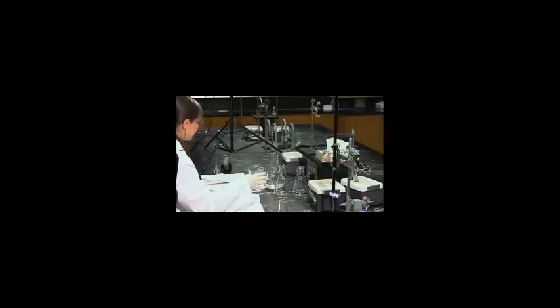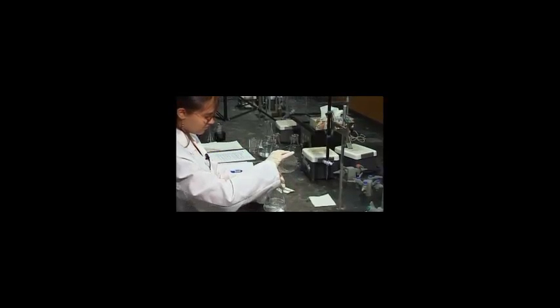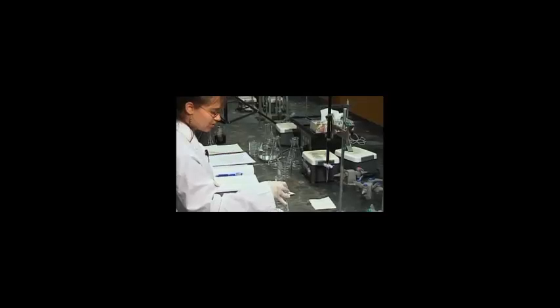So then in step 5, I'm going to add 250 milliliters of 1 molar sulfuric acid that we made in step 2 to our sodium oxalate here. And we'll swirl the solution until it dissolves.